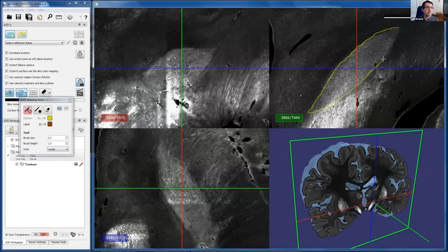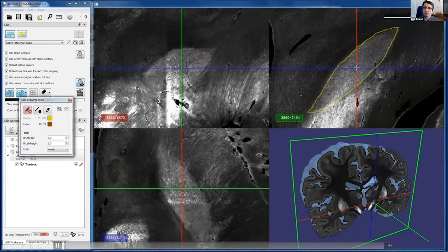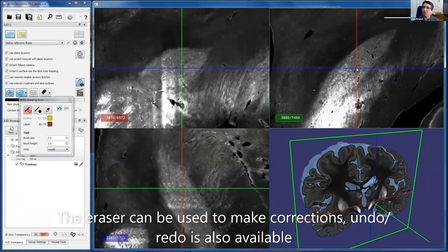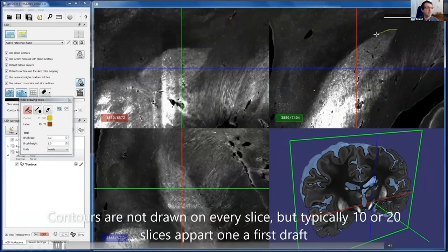So basically, you can see the window for drawing here that appears when you click the brush. The idea is you use ID 100, that yellow number in the annotation, to define a contour that can be shared by multiple structures, so it can be a frontier. And then to inform the software, the reconstruction algorithm, you'll put a dot of color with the other pen tool here.